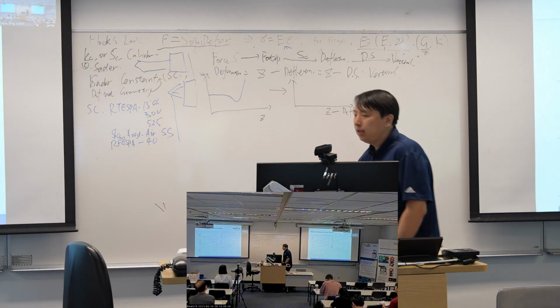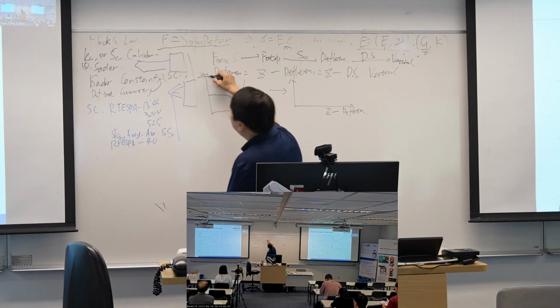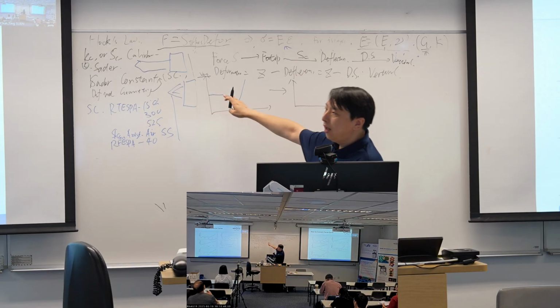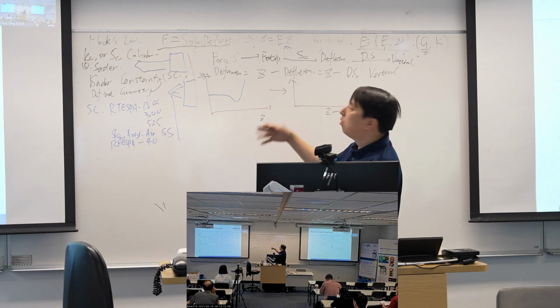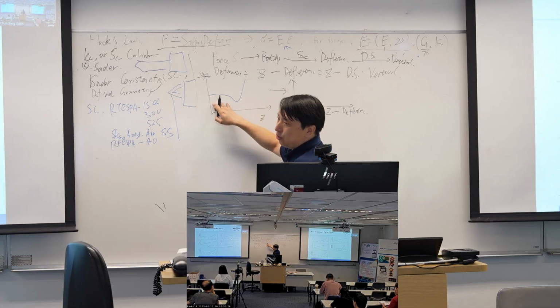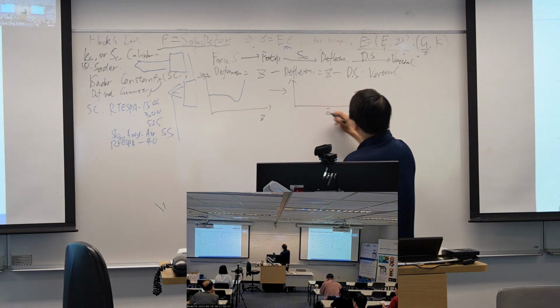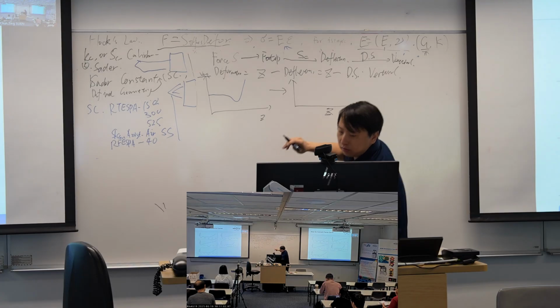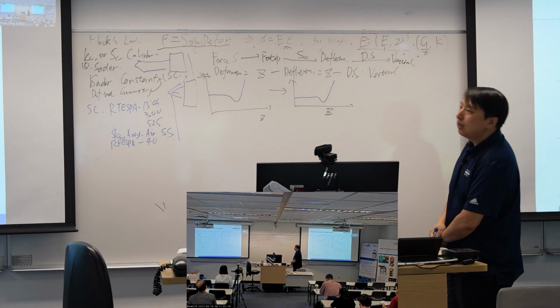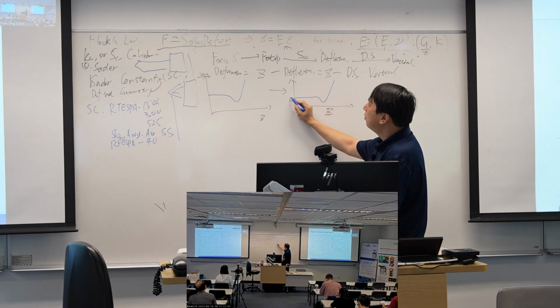But remember, before that, we need to do one thing. Our vertical value has a baseline, something like this. On the baseline, we think the probe does not sense any force, so we need to subtract the baseline. After the baseline subtraction, this baseline value should be 0.